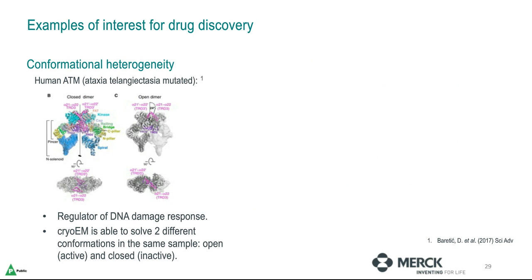Besides target identification, one of the most exciting advances that CryoEM offers is the possibility of solving the structure of different conformations for the same protein in a single preparation. The proteins can modify their structure during the execution of the function, and every different structure that the protein can adopt is called a conformation. If the number of conformations is discrete and statistically relevant, CryoEM can produce individual structures for them with a single data set from a single preparation, giving an important amount of information to understand the mechanism of action of the protein and then to be able to treat the disease.